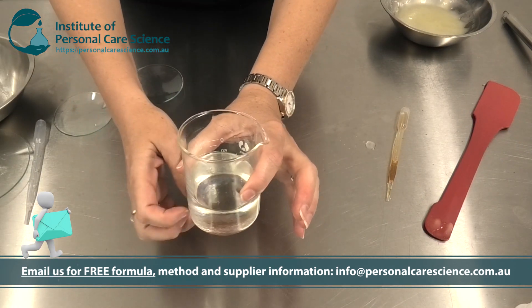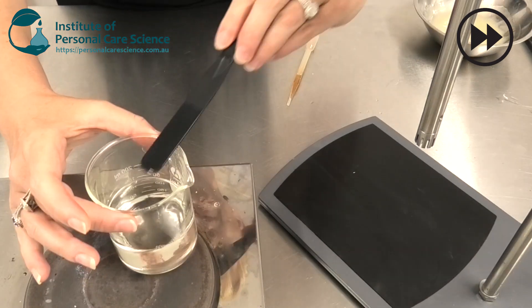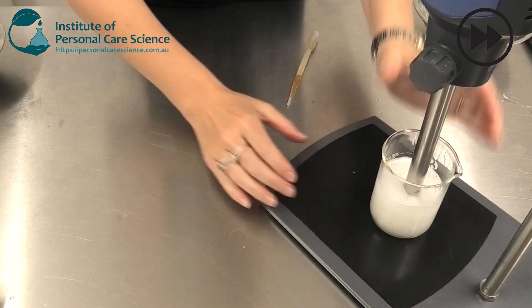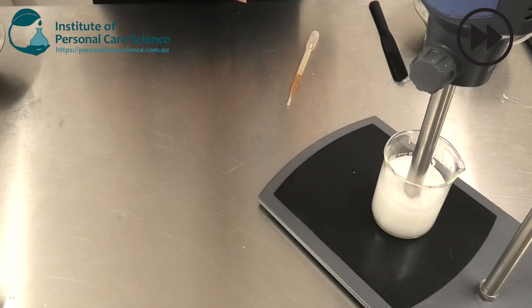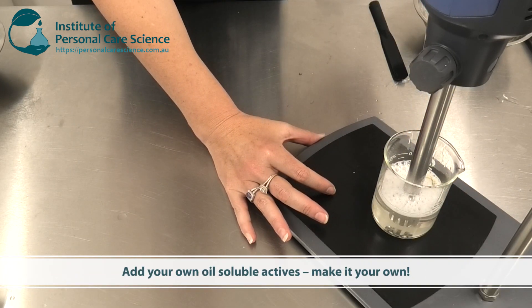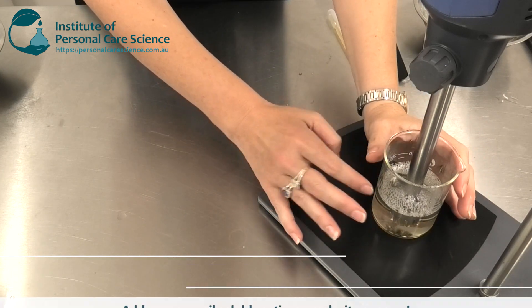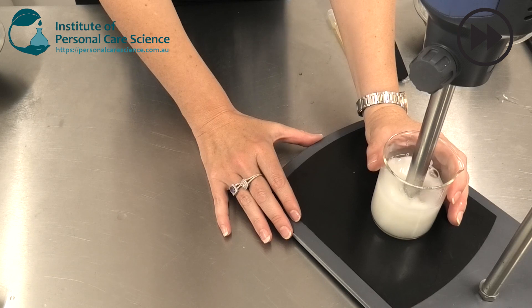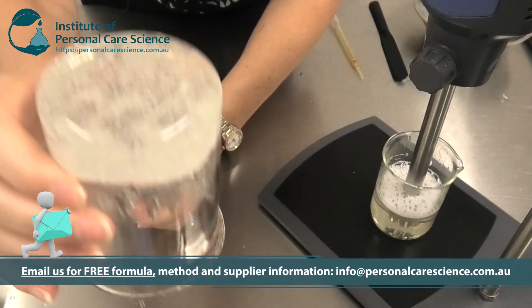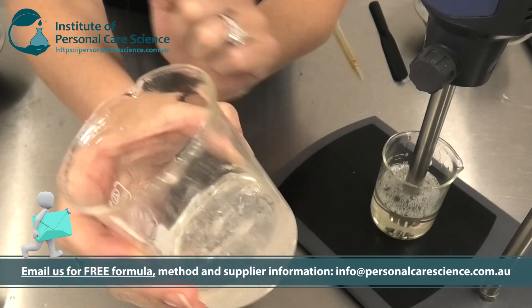I need to heat and high-shear this phase to form my stable oily gel. Once the oil phase has cooled below 40 degrees I can add any heat-sensitive materials and stir through — of course, if materials aren't heat-sensitive they can be added earlier while it's still hot. Once it sets into its gel it becomes this very solid-looking oily phase gel, which is very easily pumpable and even sprayable because of the Oilkemia 5S.